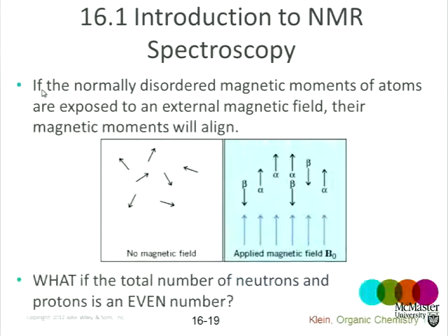All right, so last time we covered carbon-13 NMR, and I hope you've had a chance to practice that a little bit and recognize that really carbon-13 NMR is very easy. It's a way to basically just simply count the number of carbon atoms of different types in a molecule. So we can tell, for example, if there's a ketone in the molecule, there'll be a carbon-13 NMR signal at about 200 ppm on the mystery ppm scale that we'll talk about tonight.